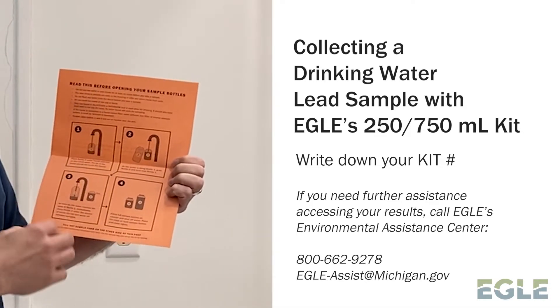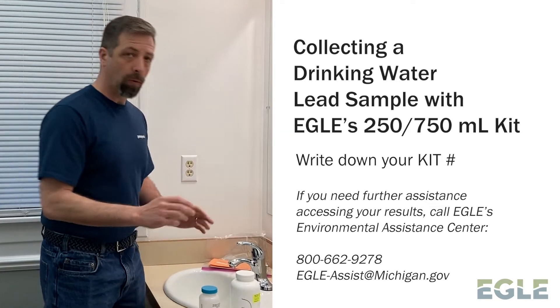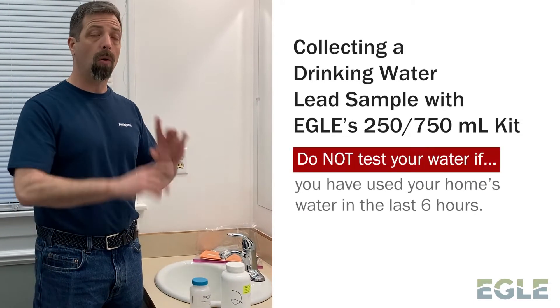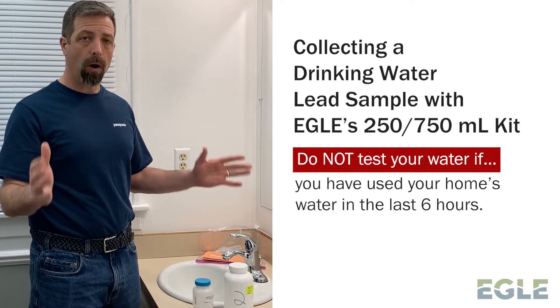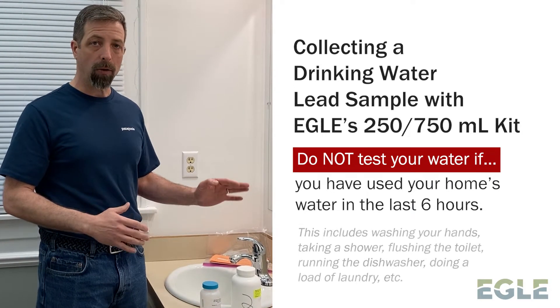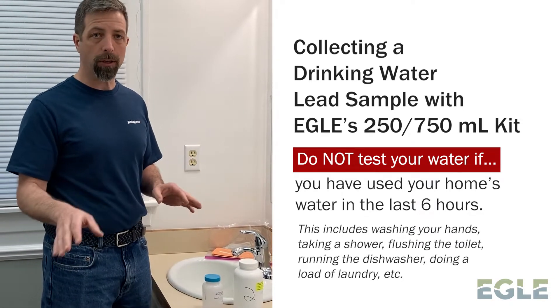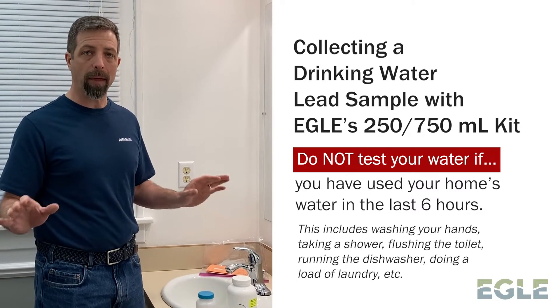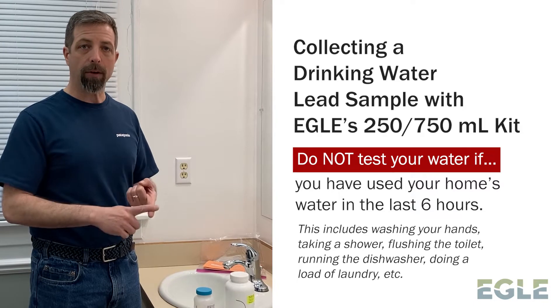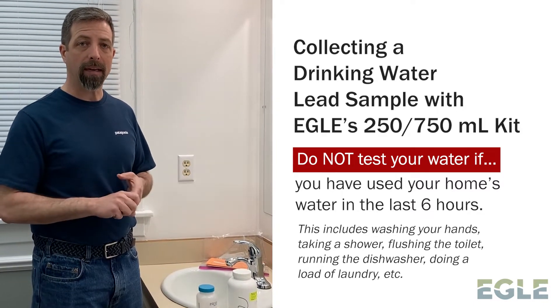You'll want to make sure that you review these documents thoroughly, but I'm going to discuss much of it right here. As you're starting to get ready to collect your sample, the first thing to know is that you must have let your whole house water remain motionless for at least six hours prior to sampling — meaning you don't want to flush the toilet, run your shower or sinks, or use your dishwasher or laundry machines. You want everything to stay without water use for at least six hours.